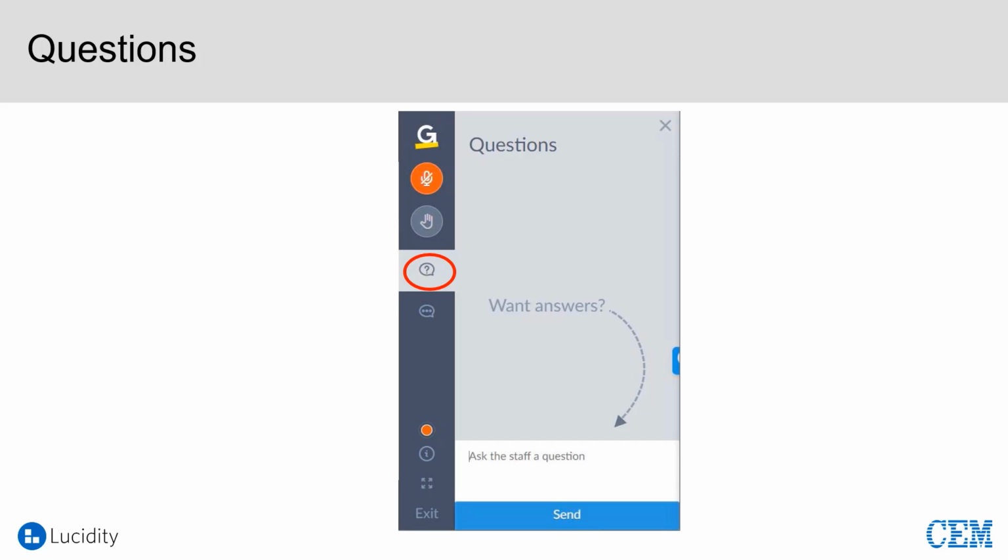I might use an example from my work in SPME, which over the years has really been toward the analysis of drugs. Drug analytical chemistry methods are usually fairly complex because we're extracting the drugs from urine or blood or some other nasty matrix like that. So what would happen is, the SPME method might be greener, but the urine gums up the fibers a lot faster than extracting from water, and the fibers are more expensive.